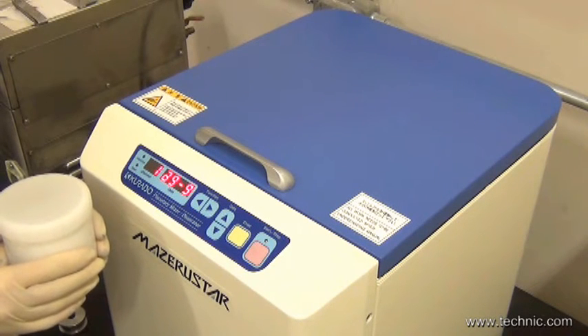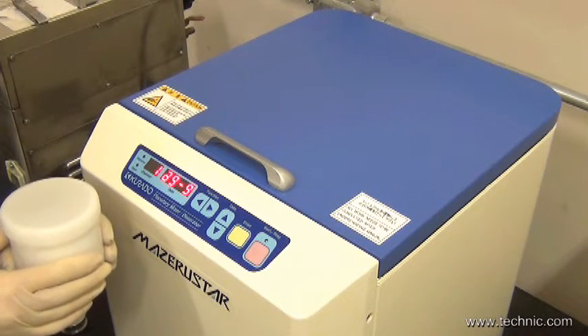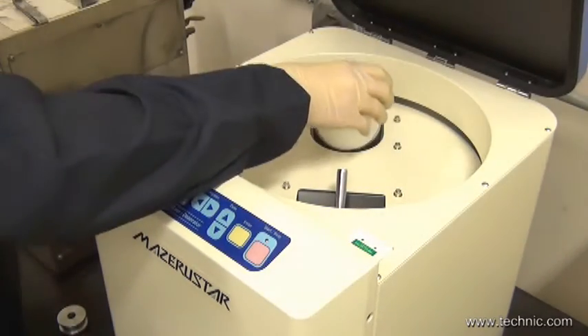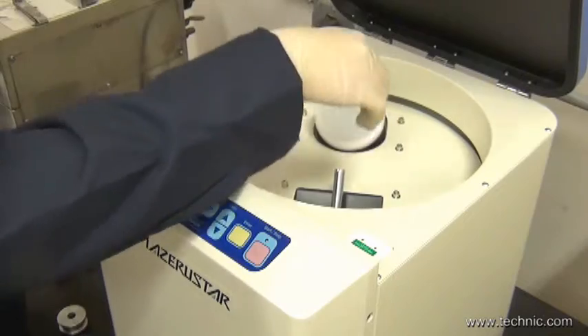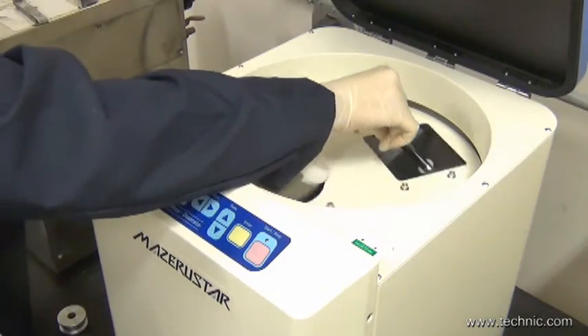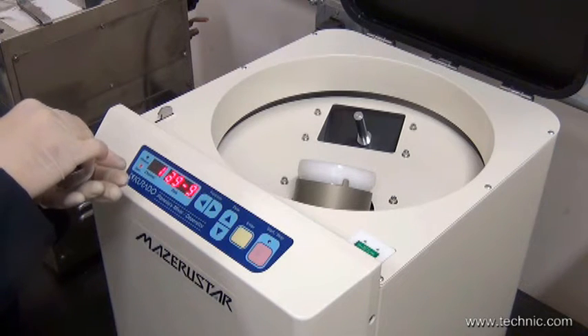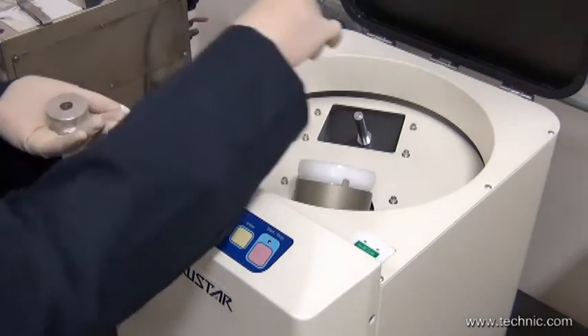Next, we put the standard container into the Zero Star model KK 250. We want to be sure to put the counterweights on the counterweight post. The weight will be equivalent to the net weight in the container.